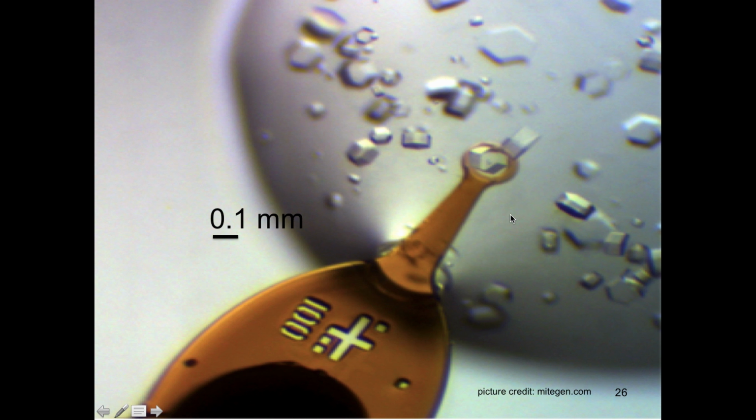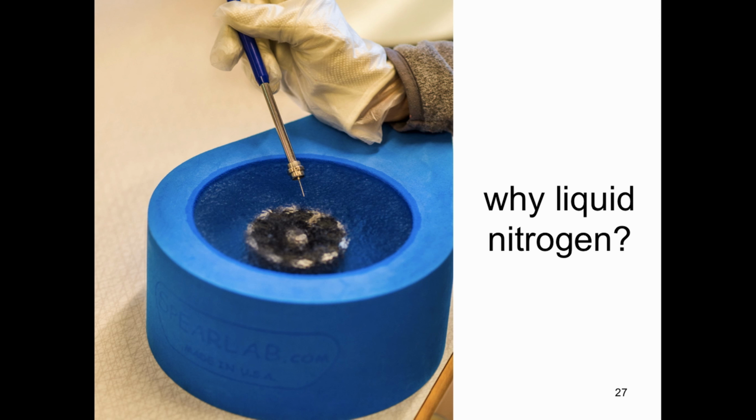This drop is only 0.2 microliters. It's sealed. So to get the crystal out, we're going to have to take the seal off the experiment and go fishing with this loop. And as you can imagine, a drop that's only 0.2 microliters is going to dry out very fast indeed. So you have to have great skill and be fast. That crystal has to get out of the drop and into the liquid nitrogen quickly.